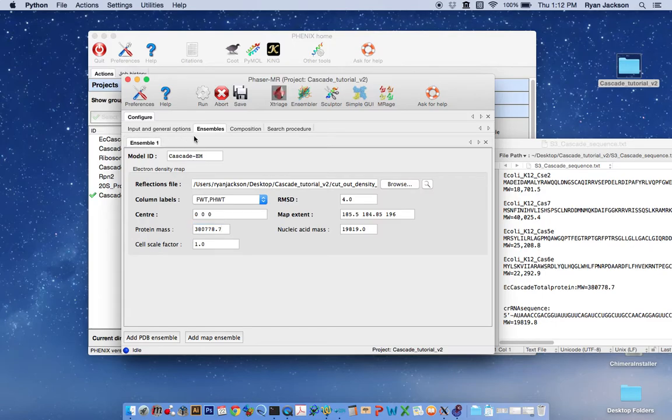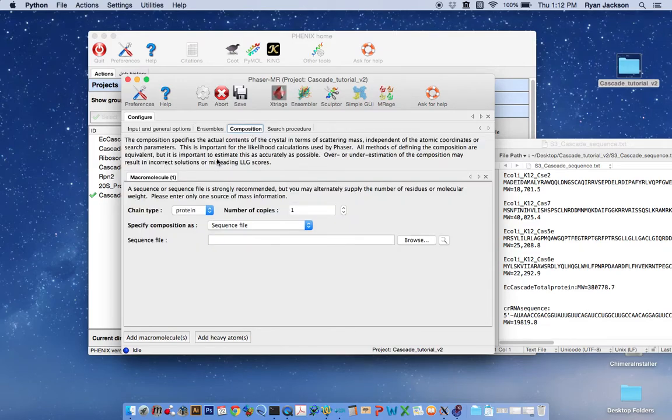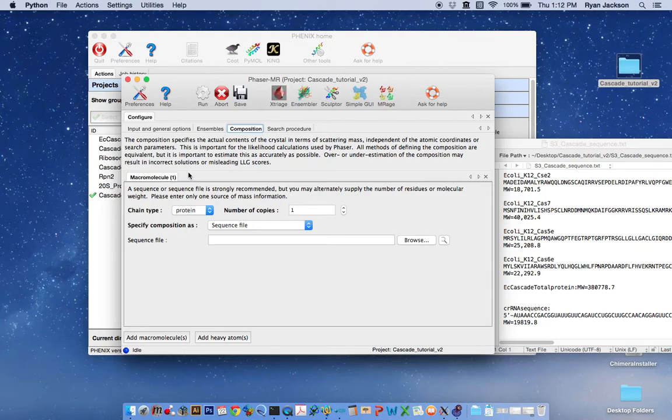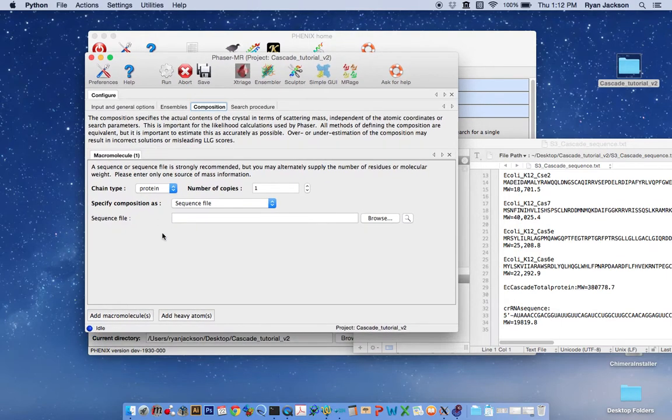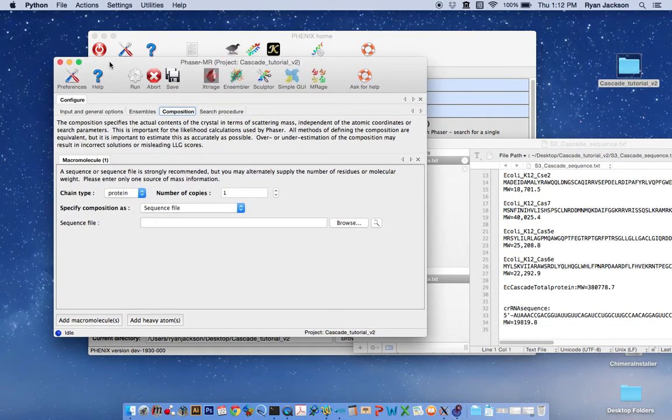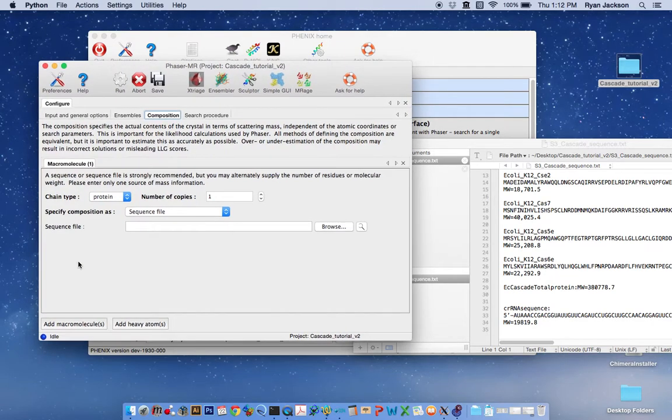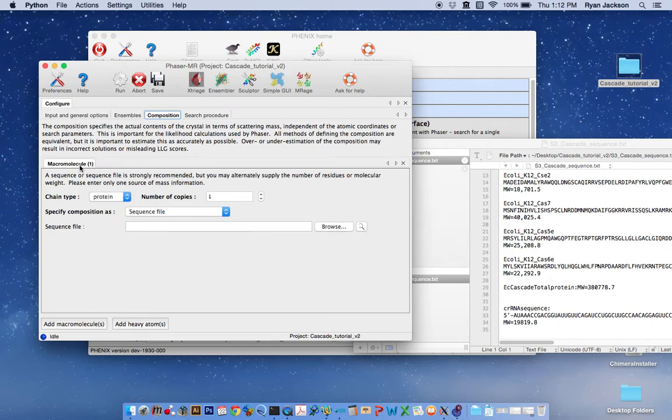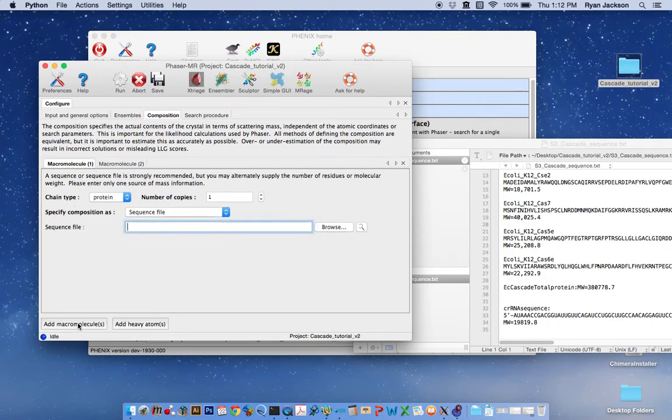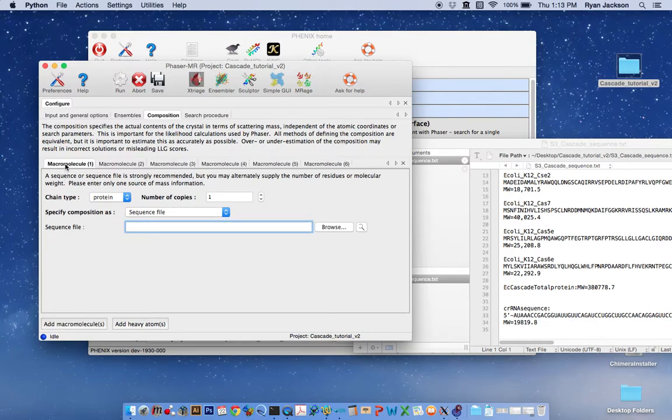So now we've created a new map ensemble. We need to tell phaser something about what we expect to be in our crystals. And so here we need to fill in the macromolecules that we expect in the crystal of Cascade. And this is where running a Matthews coefficient calculator to guess how many assemblies you might have in the unit cell will be helpful. I'm not going to run through that at the moment, but I have done that and I expect that there will be two cascade assemblies in the asymmetric unit of my crystals.